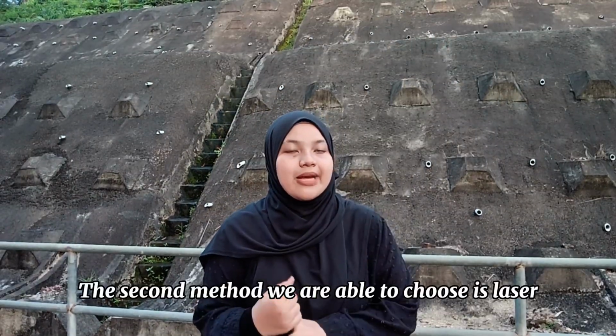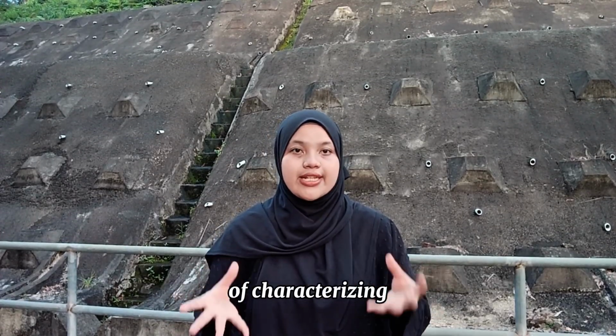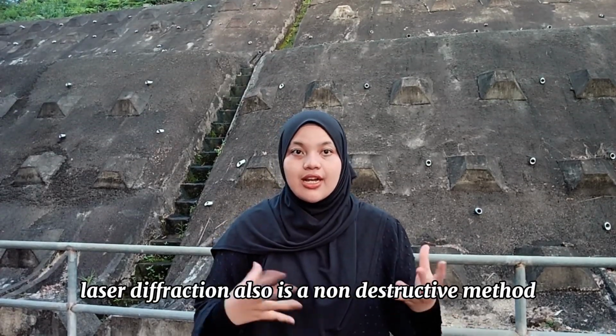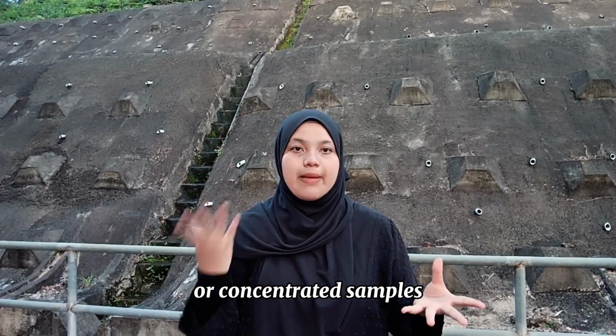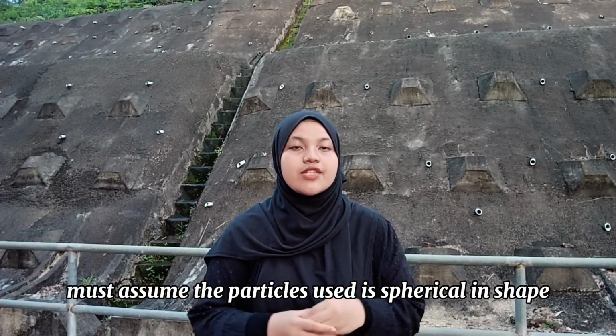The second method you are able to choose is laser diffraction. Laser diffraction has a wide dynamic range of characterizing, which is more sensitive in the micrometer range. Laser diffraction is also a non-destructive method. However, some limitations can be observed: this method is not suitable for very diluted or concentrated samples. This method also must assume the particles used are spherical in shape.